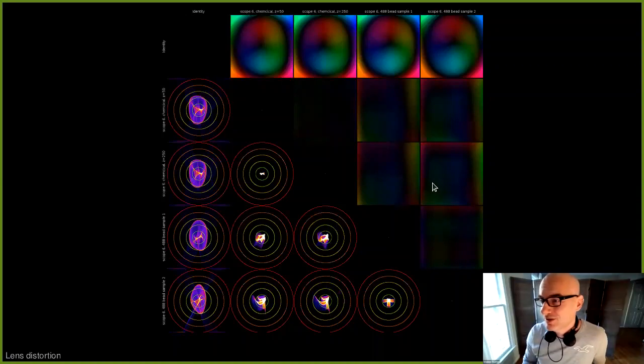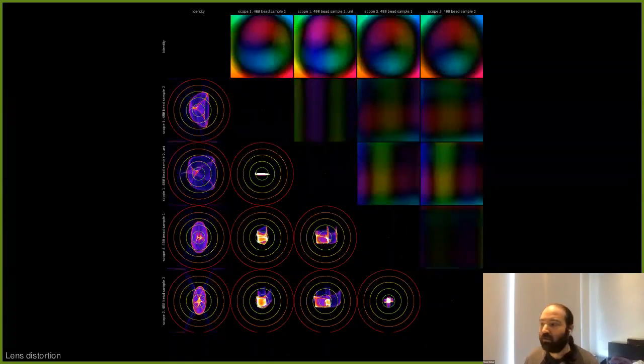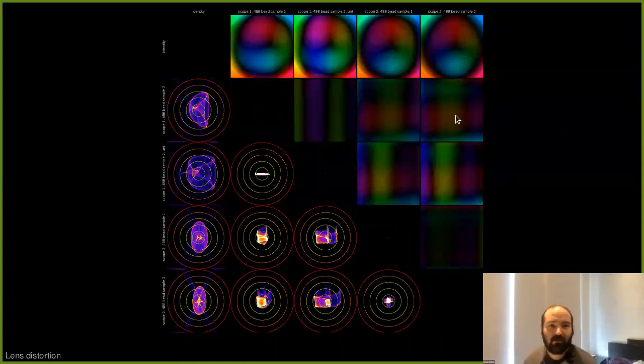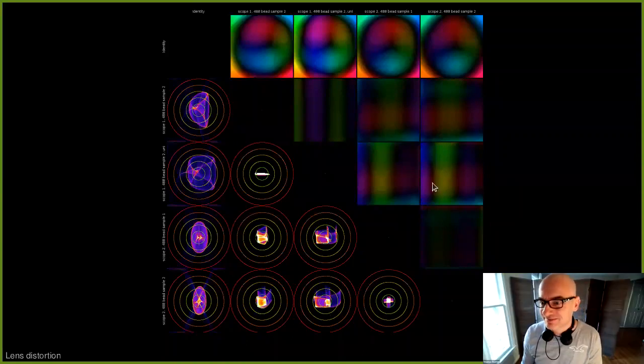We usually use like 60% overlap, but it's also not super accurate. So these calibration sets with overlapping tiles are actually better when they're totally random. But when they're totally random, if you still see this, then my hypothesis is wrong. Right. Yeah. And they do use mirrors to scan. So I don't know. Right. Cool. Thanks. All right. Yeah, it's a good idea.